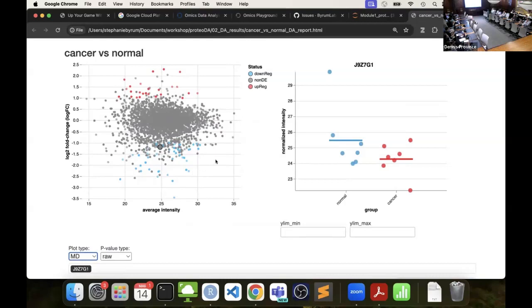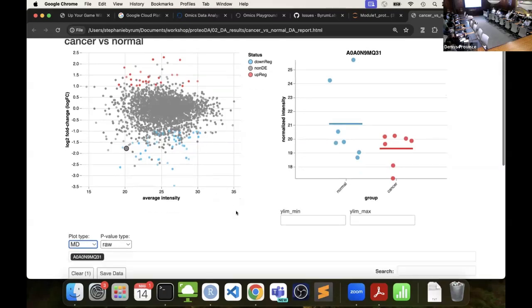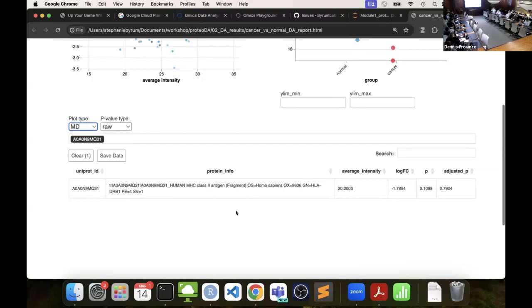And this is where serum, plasma type projects, those proteins tend to be way over here in the high abundant range, versus if you want a low abundant transcription factor, where is it on this list? Are we getting lower into that range? So I like looking at these two when we're trying to figure out where we are on the scale of abundance. All right, any questions about this?